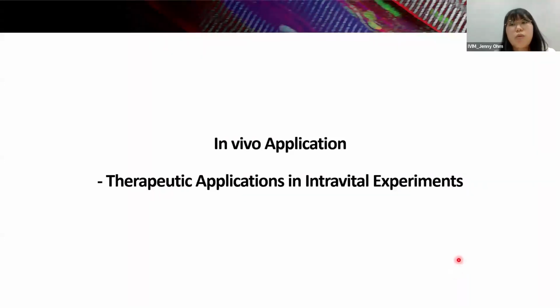So finally, you might be wondering whether our imaging platform can also be used to visualize not only disease progression and recovery in various models, but also the distribution and efficiency of different drugs. To address this, I've also prepared a few study examples in the next couple of slides.